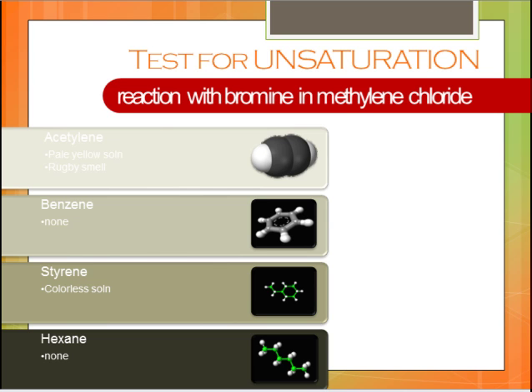Okay, so it's really interesting that nothing happened with benzene, because as you might know, benzene is unsaturated and yet we observe nothing. So does that mean the benzene we tested isn't really benzene? No. The reason that we didn't see any results is because benzene behaves both as a saturated and an unsaturated compound. The delocalized double bonds present inside the molecule make it much less reactive than more discrete double bonds, such as those found in ethylene. This makes it behave more like a saturated compound, preferring substitution reactions more than addition reactions, since the latter reduces the resonance stabilization energy.